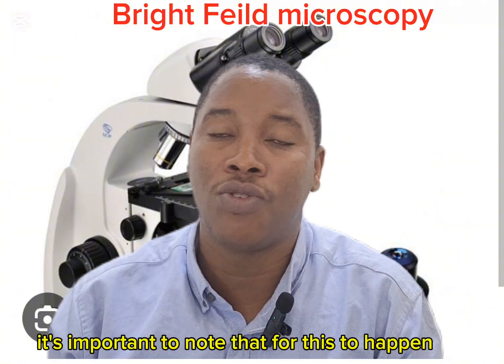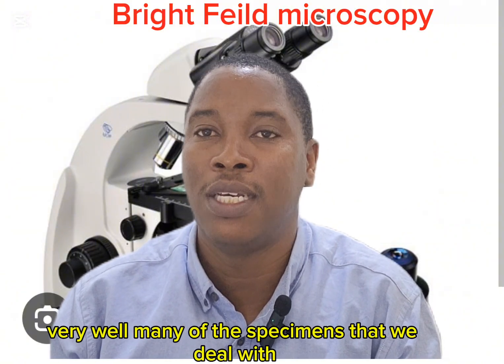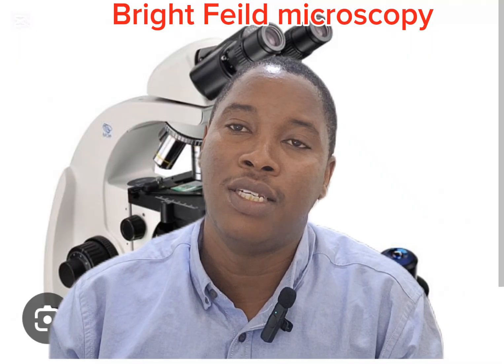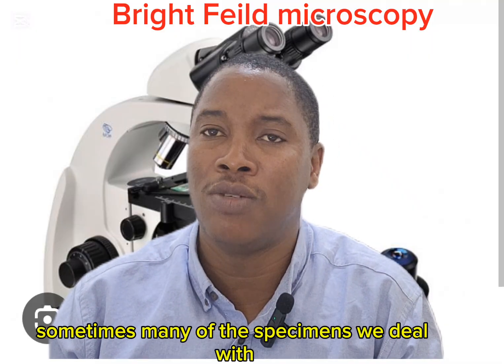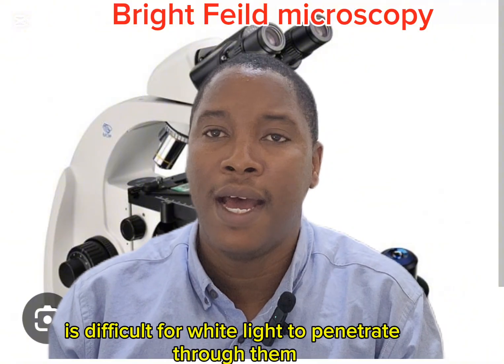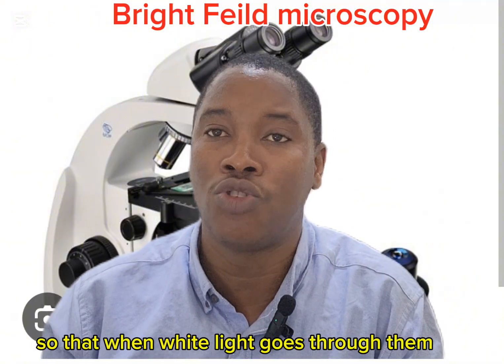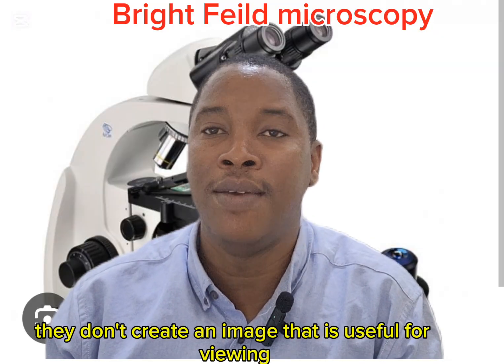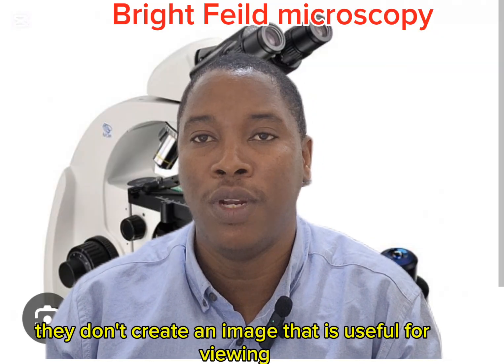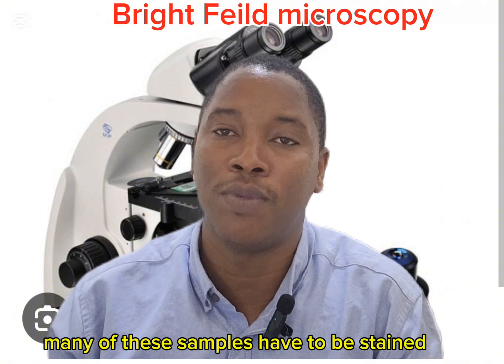Now, it's important to note that for this to happen very well, many of the specimens that we deal with have to be stained. Many of the specimens are difficult for white light to penetrate, and some of them are even transparent, so that when white light goes through them, they don't create an image that is useful for viewing. So many times, these samples have to be stained.